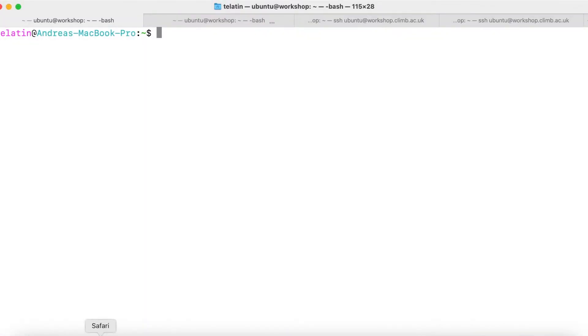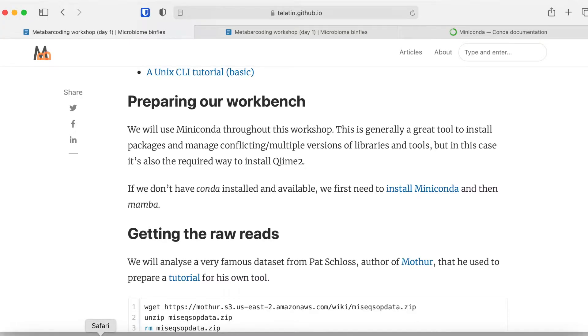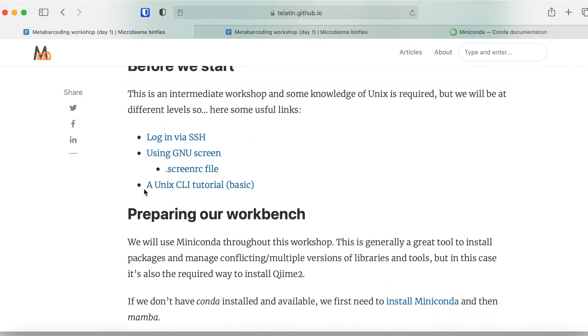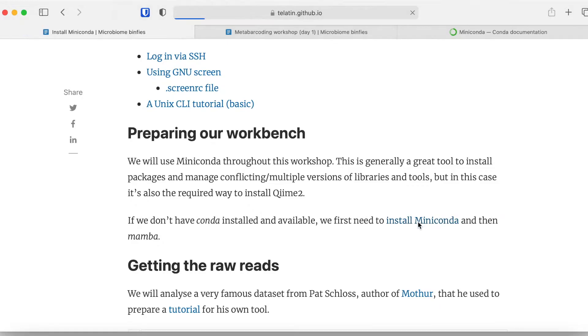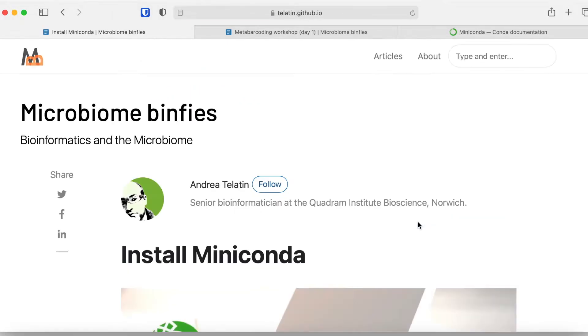I will now quickly recap what we did to set up our environment. In our workshop notes, the first paragraph is preparing our workbench, and this points to a dedicated page to install and use Miniconda.